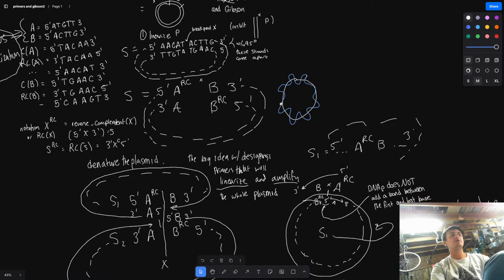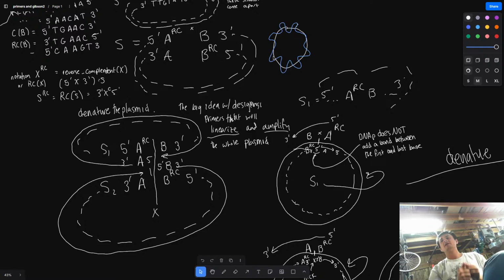Inverse PCR. The reason why I don't like inverse PCR is, you take your hands, you know how in physics they do this weird thing like this? So if you have two, like, hold on, you want it to be like this? I guess I'm looking in a different direction than you.